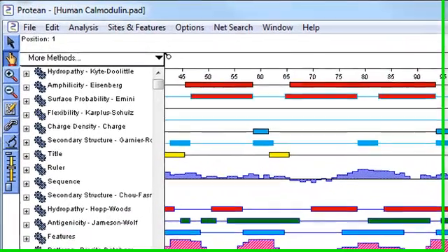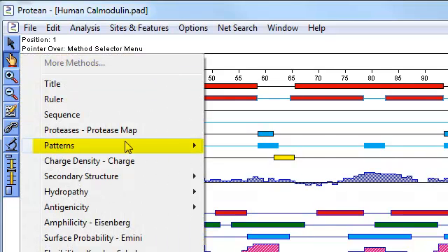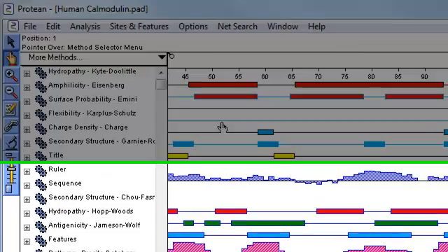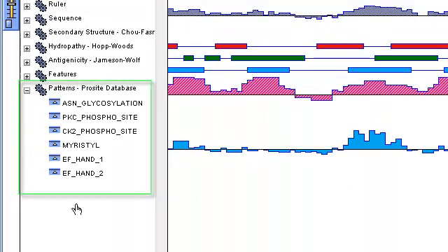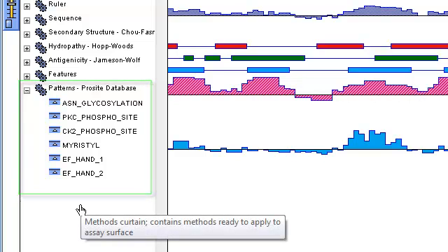One of the pattern matching methods that Protean offers is for the PROSITE database, and this can be accessed by selecting More Methods, Patterns, PROSITE database. The PROSITE database is installed with your software and can be used to identify known sites within your protein sequence.